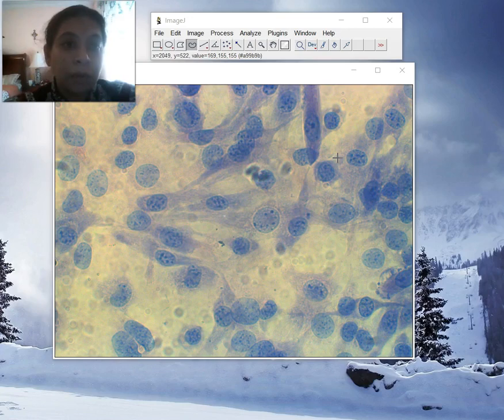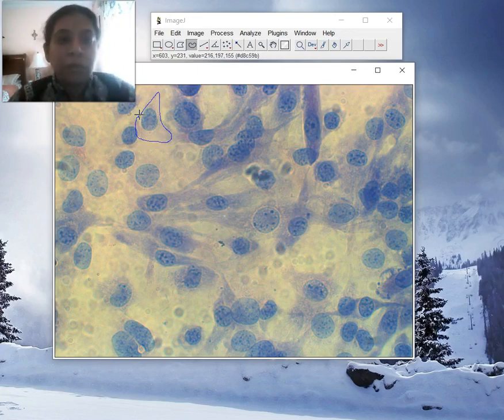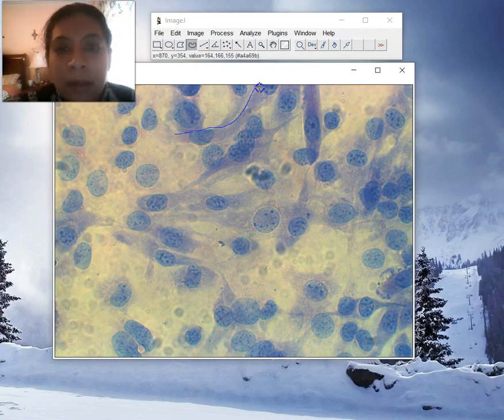This image is from a mouse myoblast cell culture that was in differentiation medium for a few hours or for a day. So they are starting to differentiate into myotubes. Now they are far away from being fully developed myotubes at this time, but you can see that some cells are still looking very similar to how they look when they're fully undifferentiated, which is kind of circular or boxy. And then other cells, so this is still a very boxy cell, while other cells are becoming more elongated and are beginning to look a little bit different in their morphology.